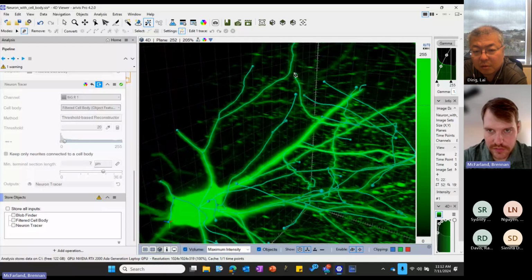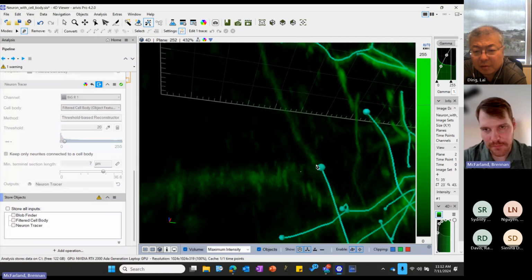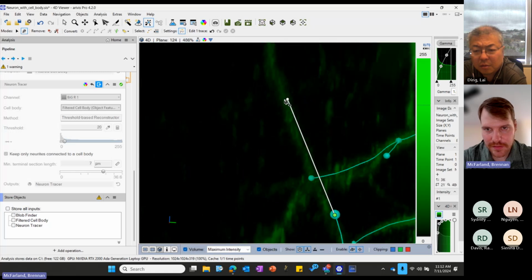Just taking a look here. So again, I probably wouldn't lower this value anymore, and I would just go and trace these myself.